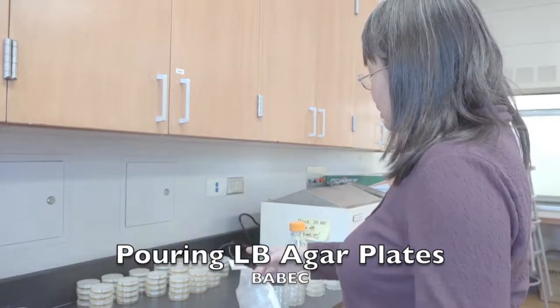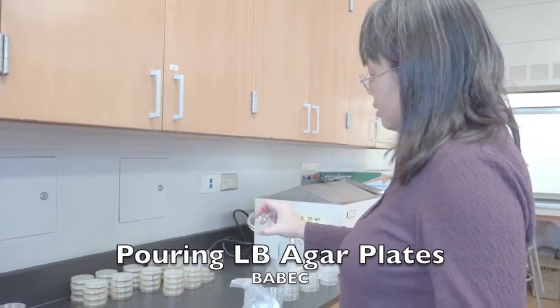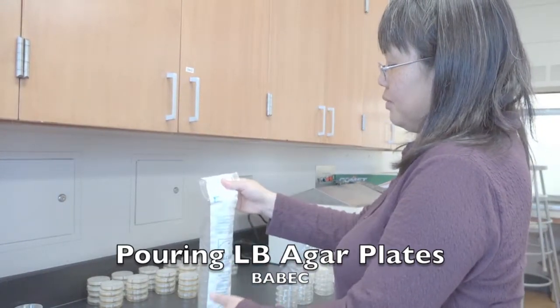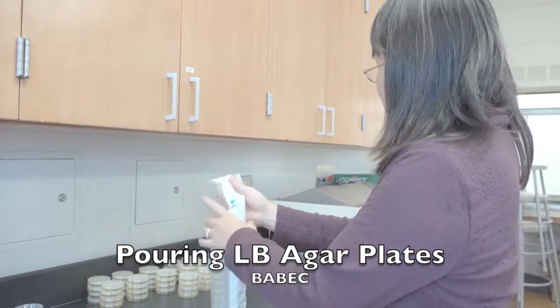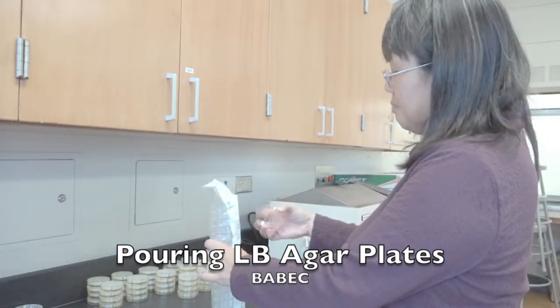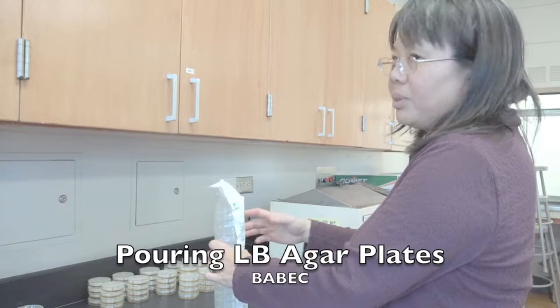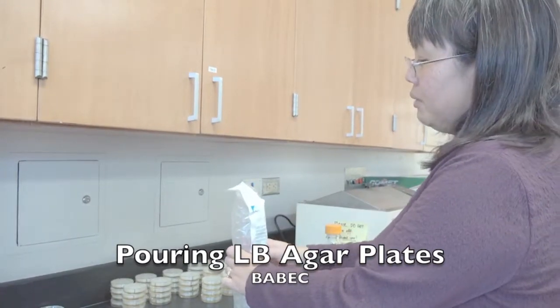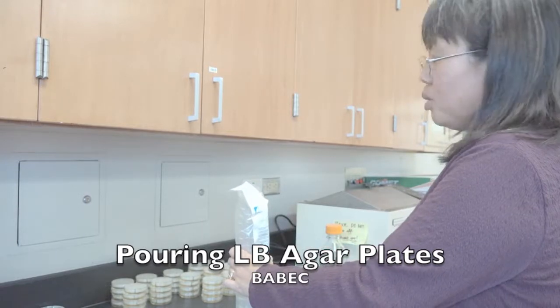Today I'm going to pour LB plates onto these 60 millimeter petri dishes. You get a sleeve of petri dishes, and each petri dish holds about 10 mils. So if you have about 300 mils of LB agar that's already autoclaved, then you can pour about 30 plates.